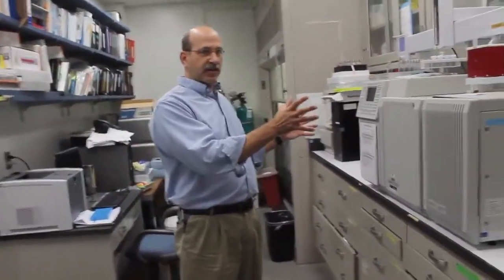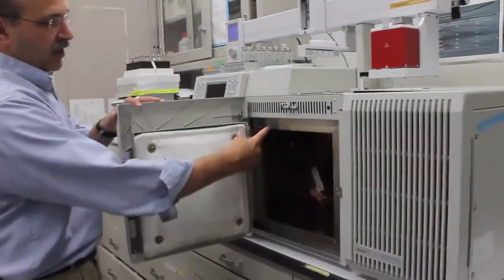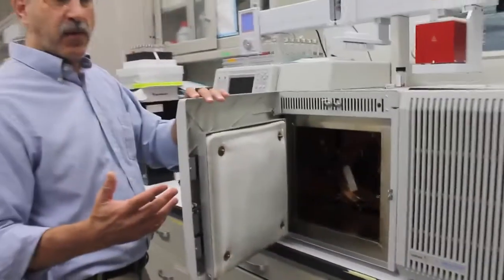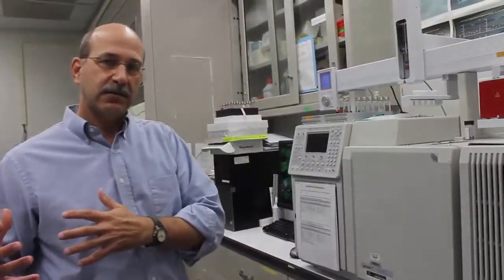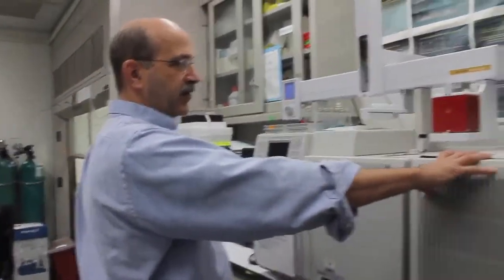We have two types of mass spectrometry. The first is called gas chromatography mass spectrometry. I'm going to show you what happens: we can separate the compounds with a gas chromatographic column. And then they are separated based on their boiling point. Higher boiling compounds come out later, lower boiling compounds come out earlier. When they come out, they go into a mass spectrometer.